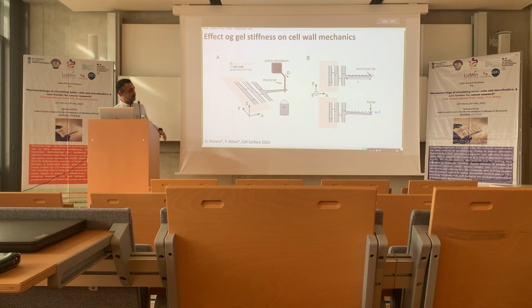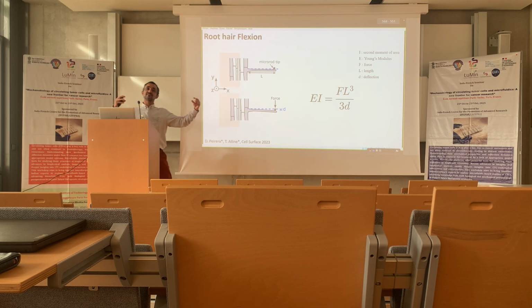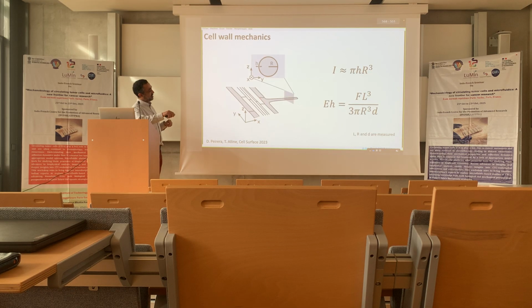Yes, so in fact what we do is what I showed you before. We just apply a deflection to the tube with the cantilever. From this deflection, we can get force and deflection. Okay, so it's very simple mechanics of a tube, but a tube with a very thin shell.